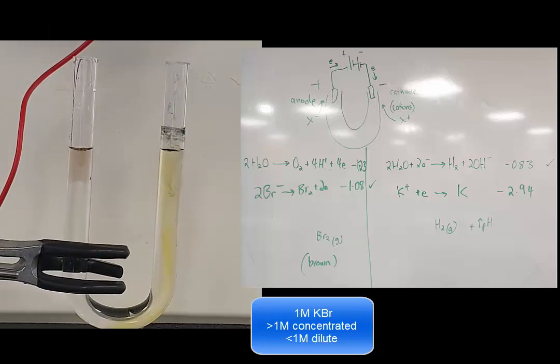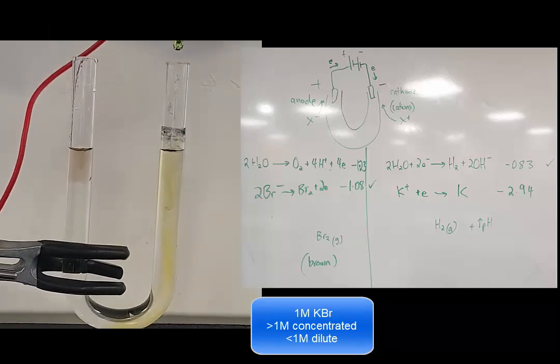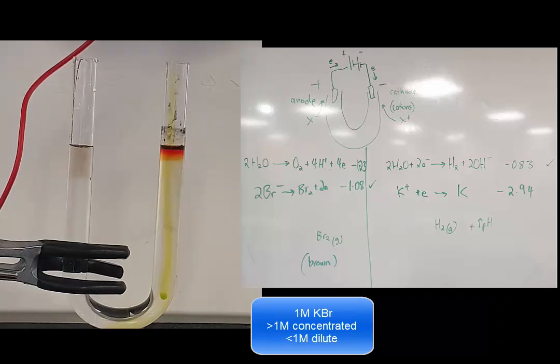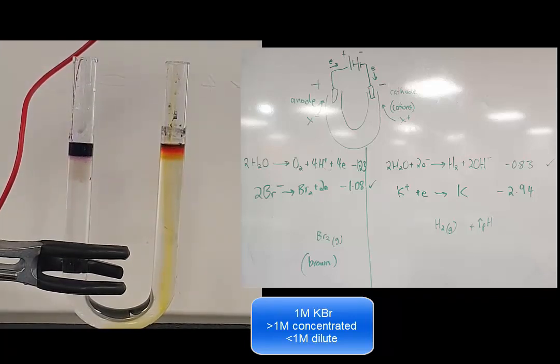As you'd expect, the left-hand side is basic. You might not have expected the right-hand side to be acidic because you could see bromine come off, but you couldn't see the oxygen coming off.